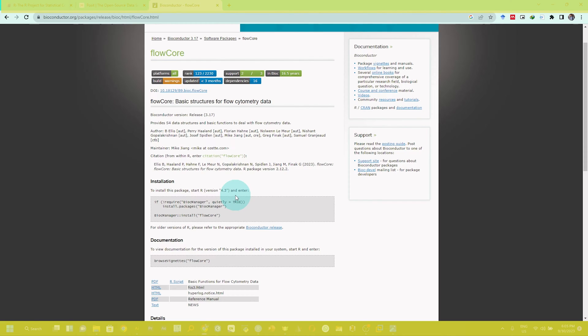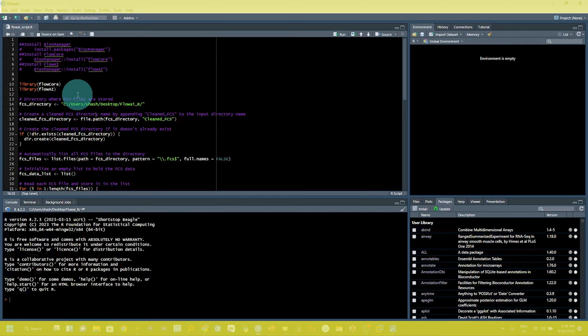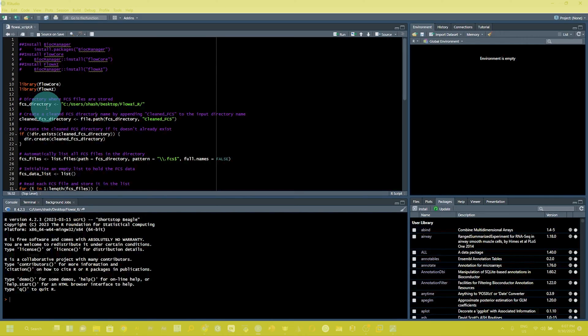Here you can see my script for flowai data analysis cleaning. This is an automated script for multiple fcs data files present in the respective folder. I will also share this R script file as an HTML file that everybody can use.